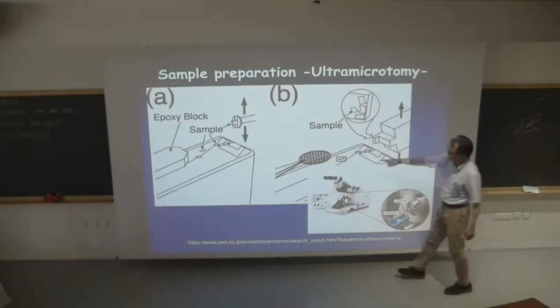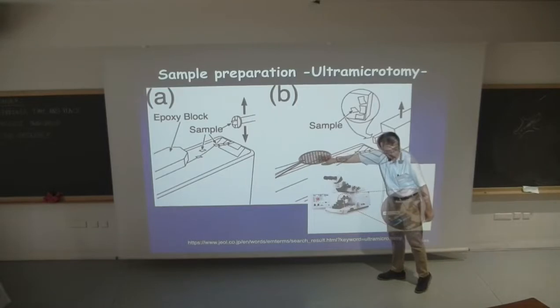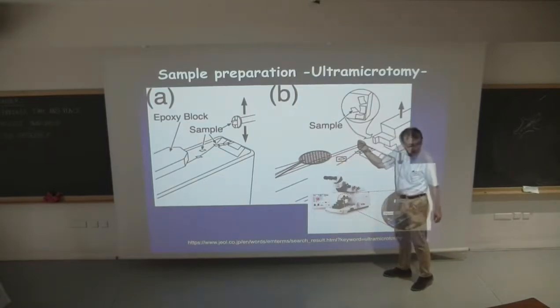That's here. So you have a copper grid, and then you actually pick it up. Yeah, indeed, pick it up.